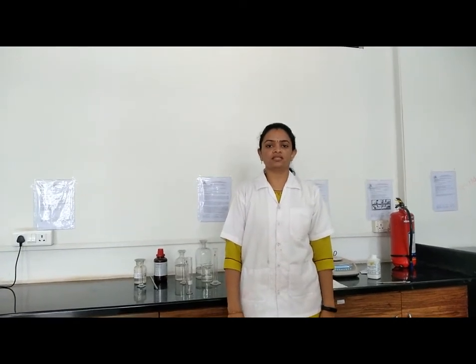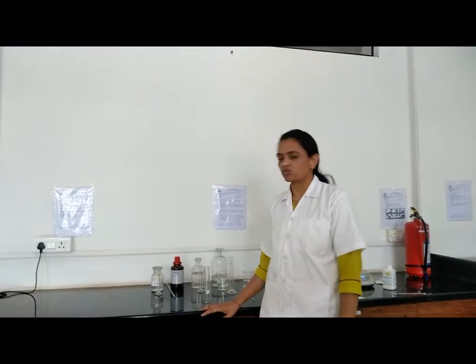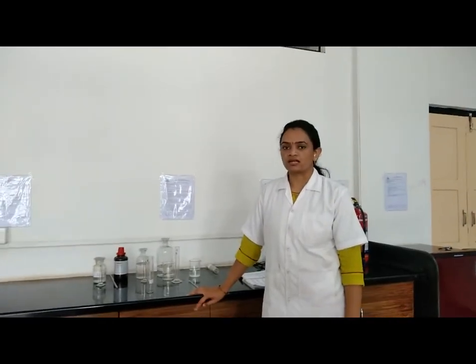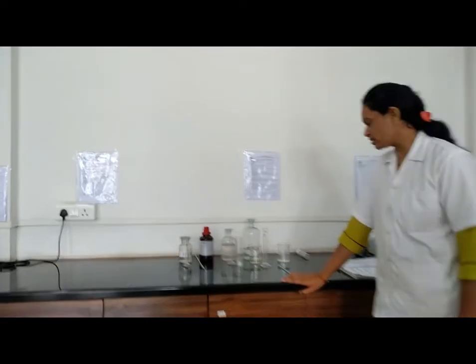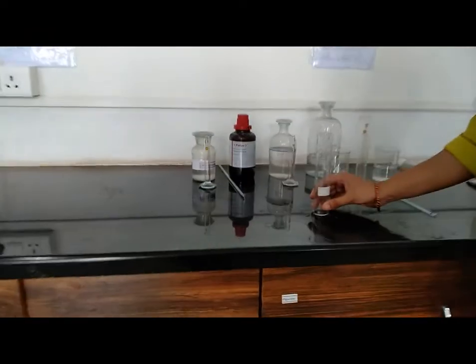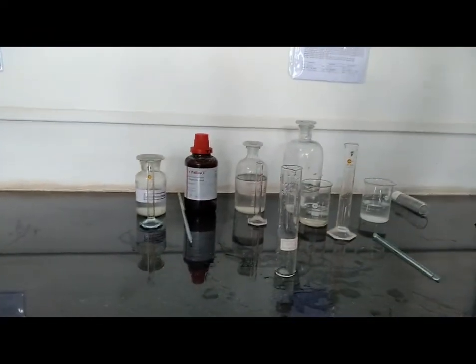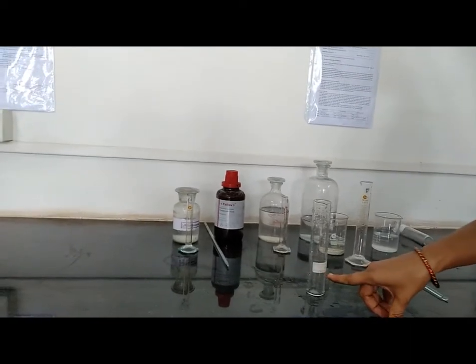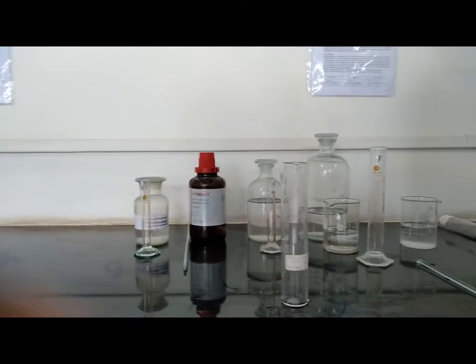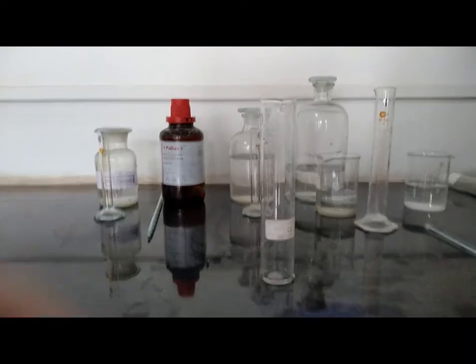Welcome in chemistry lab. So today we are going to do the limit test for iron. So let's start with actual practical. First of all we have to prepare standard solution and then prepare test solution. First of all take a Nessler cylinder and label it as standard solution. So let's start with procedure.